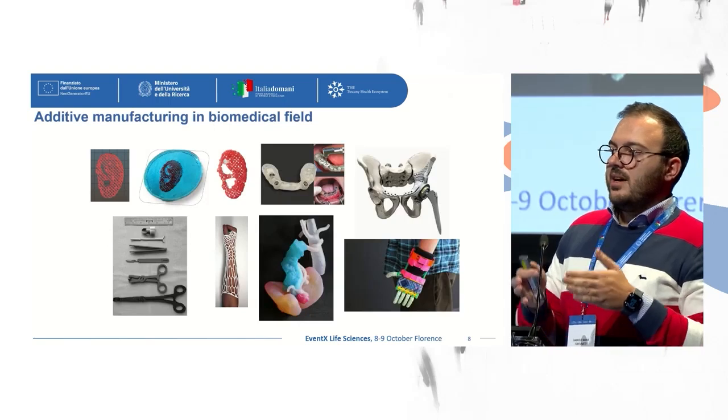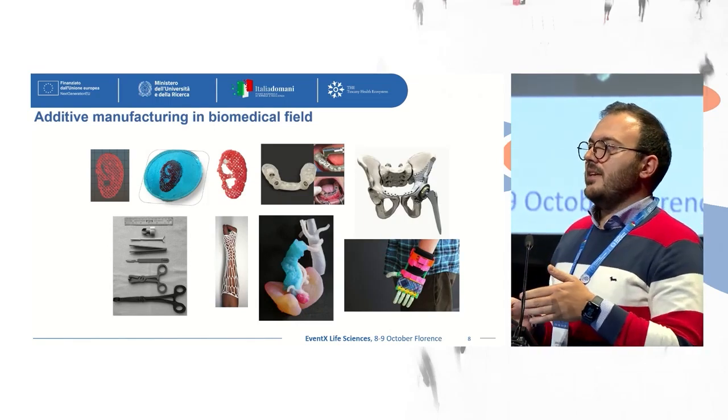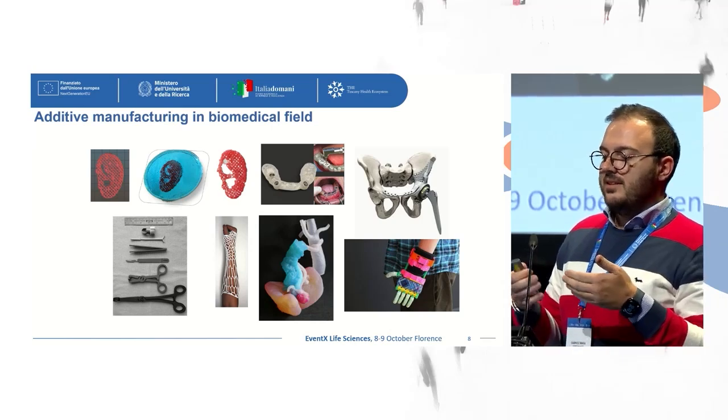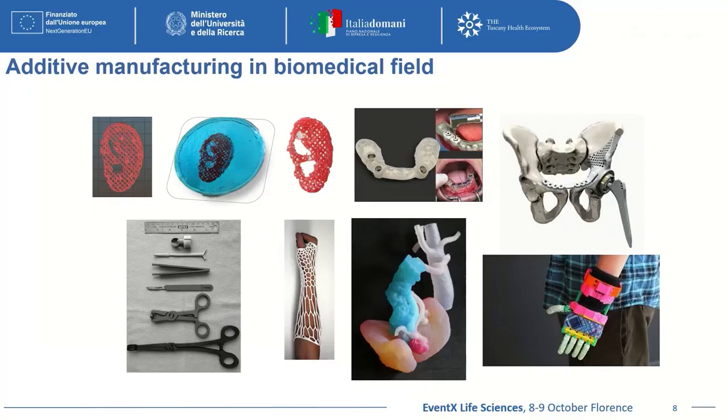If we talk about additive manufacturing in the biomedical field, there are a lot of applications. As you can see in this slide, these are only a few of the applications that can be found in the biomedical field. In the upper corner on the left, this is an example of bioprinting, because it is an ear model that was realized in our lab in Pisa.